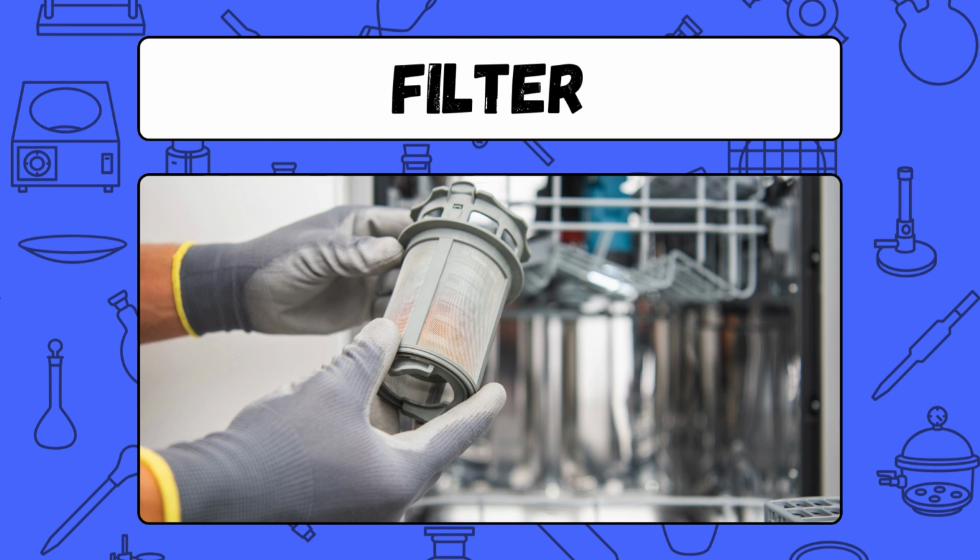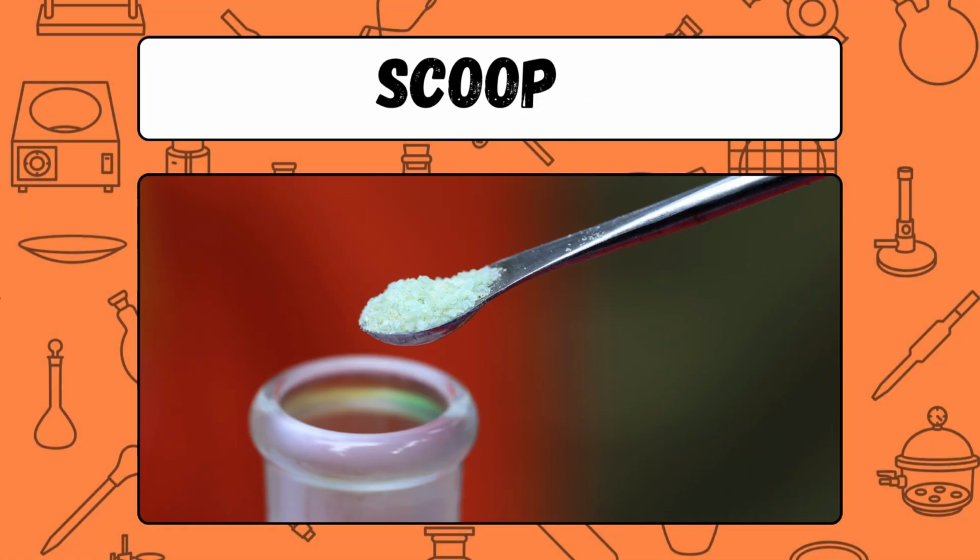Filter. A filter is a device used to separate solids from liquids or gases by trapping particles. Scoop. A scoop is a small handheld tool used to transfer or measure powders, solids, or liquids.